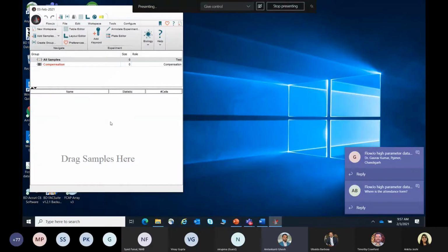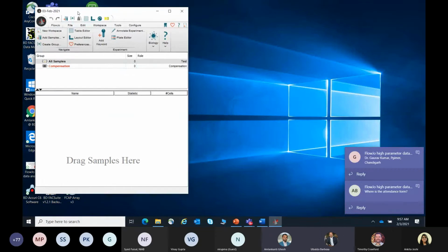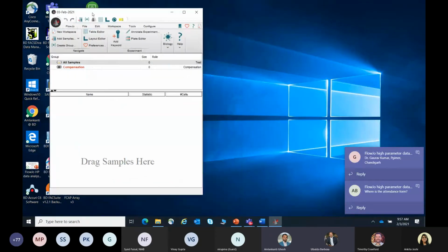Okay, so Ankita, I think the rest of the questions we can have in the second break, right? Yeah, right, Amlan. Okay, so now I will again pull up my screen and we'll try. Can you all see it? Yes, it's come up, Amlan. I can see the FlowJo software. Okay, great.